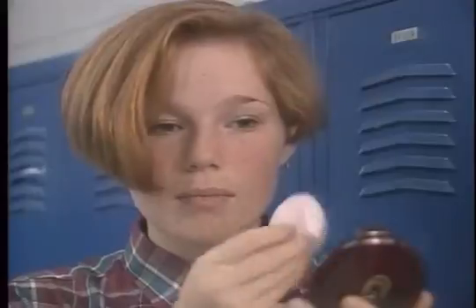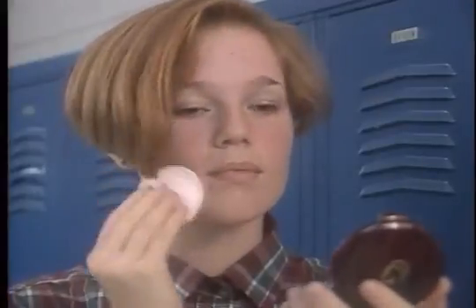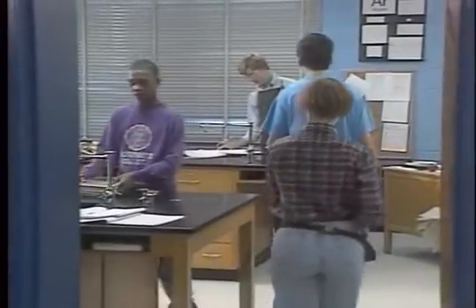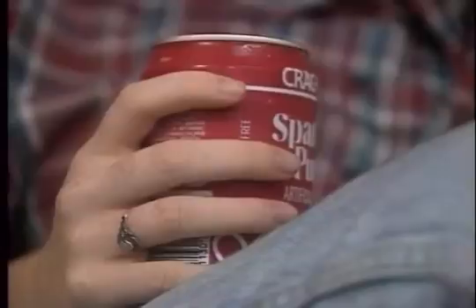There are behavioral rules to protect you against less obvious hazards, too. Applying makeup may seem harmless enough, but chemicals and vapors and spills in the lab can contaminate it. Then when you apply it to your face, you put on the chemical too. So keep makeup outside the lab. Eating and drinking in the lab can cause similar problems. Chemicals can contaminate your food or splash into a drink.